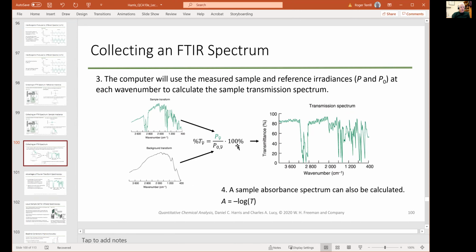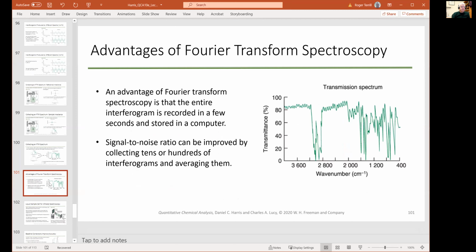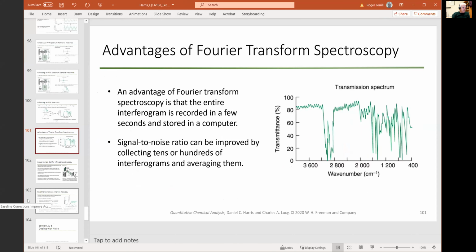together. And sometimes you get a wiggle frequency in there that's actually in the sample. If you've got a thin film in the sample, that can give you another type of interferometry happening. But in any case, you get this transmission spectrum, and then you can work with that.